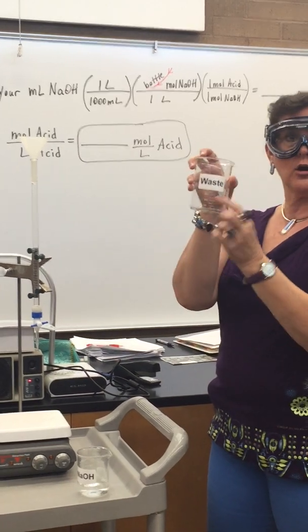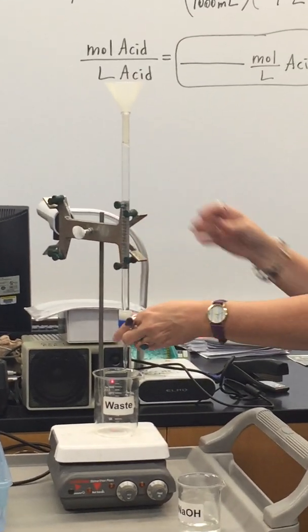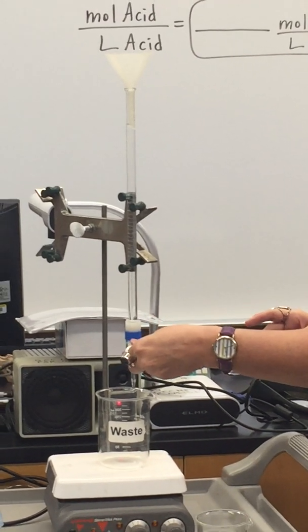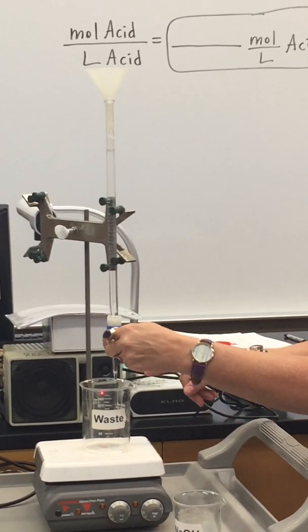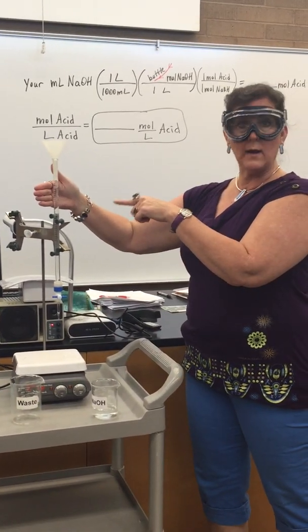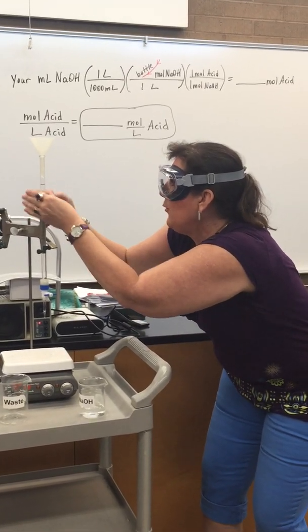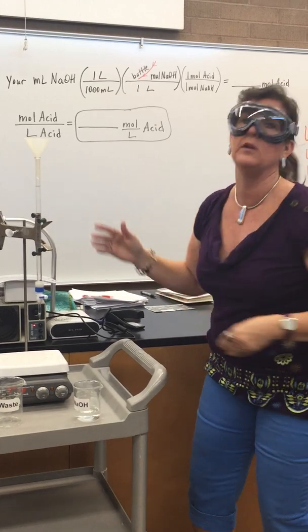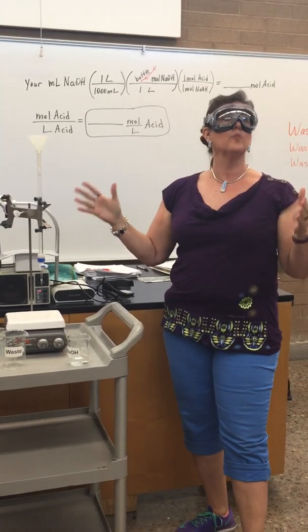Place a waste beaker underneath the burette, lower the burette down, and drain it to close to three — somewhere around two to three. That gets the air bubble out of the tip. Now take the initial burette reading to two decimal places. Mine is at about 2.32. We're going to start somewhere around two to three, recorded exactly — that's our initial volume, and the burette is ready to go.